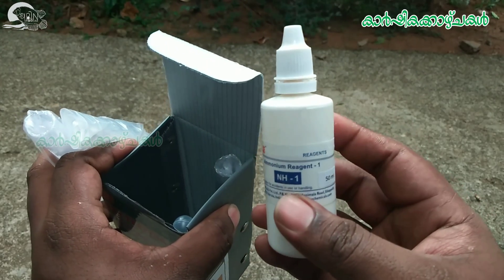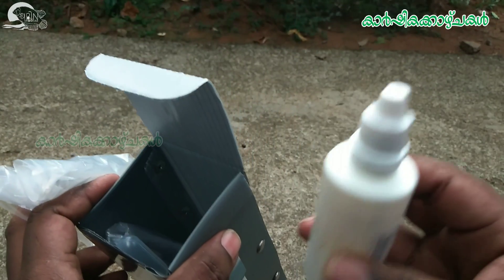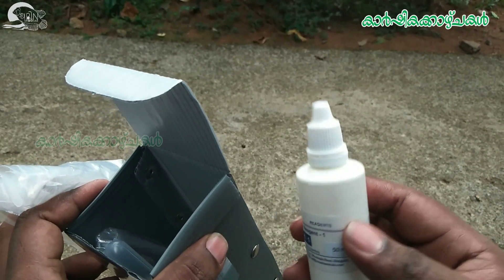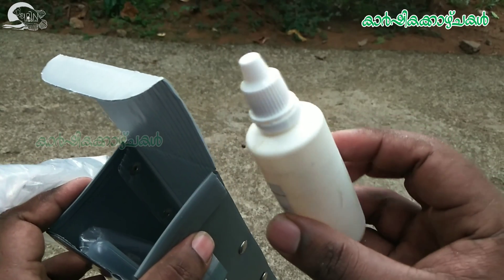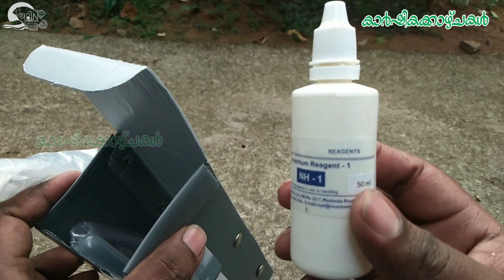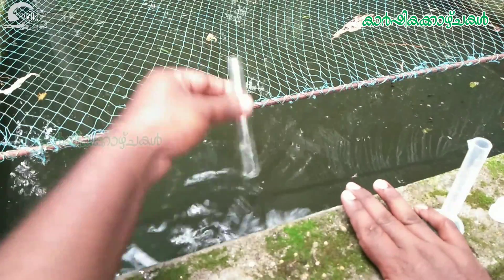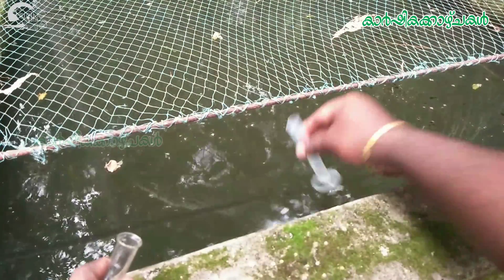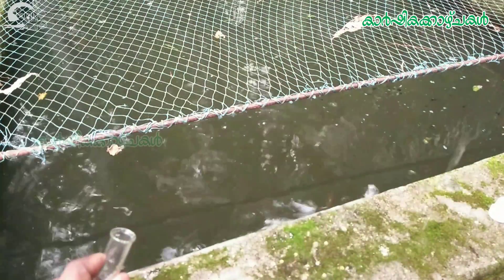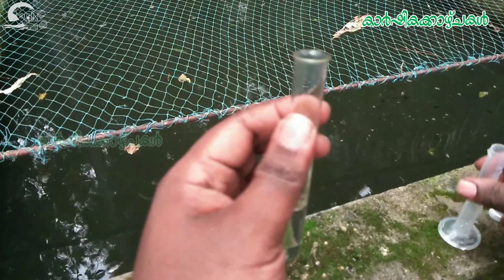I have a test tube. I will add this to this reagent. I will add it to the test tube. Now, we'll take a step in the middle of this — let's do this.